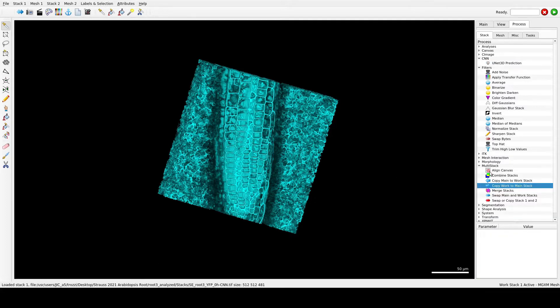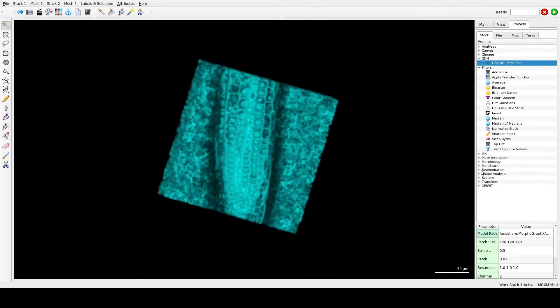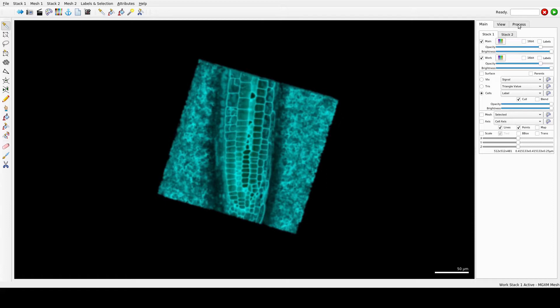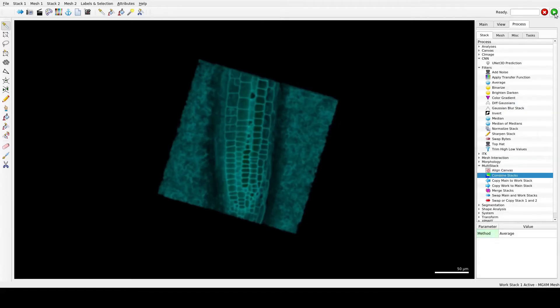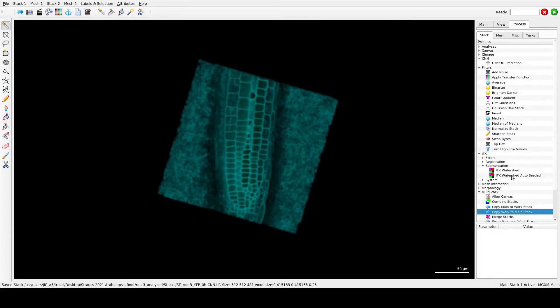Now you can blur the stack again. We can combine the Main Stack and the Work Stack by running Combine Stacks — remember to tick also Main — then click OK and Run. Now we can segment the cells by running Stack > ITK Segmentation > ITK Watershed Auto Seeded.